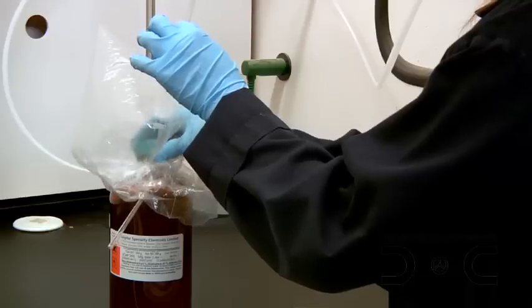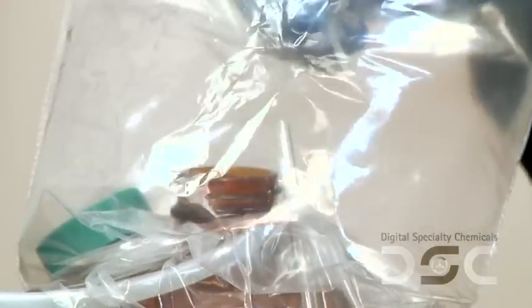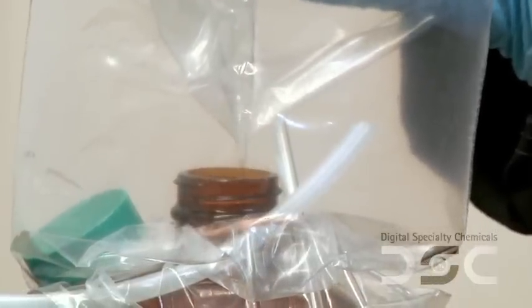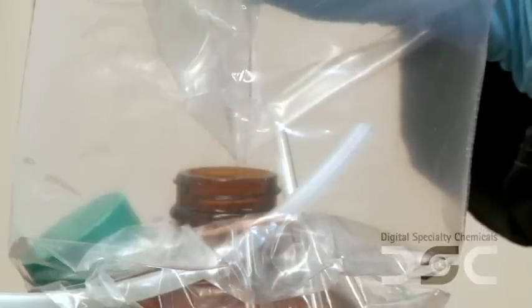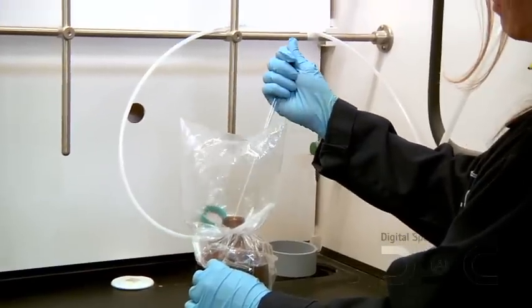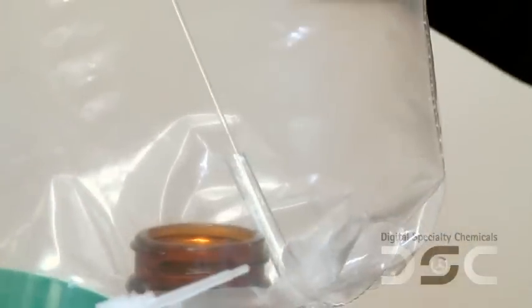Next, remove the lid from the bottle and open the sample vial or tube. Insert the pipette into the product liquid and flush the pipette two to three times with the sample, being sure to return each flush back into the product liquid. Take up about half a milliliter of sample in the pipette, then transfer it into the vial or tube.